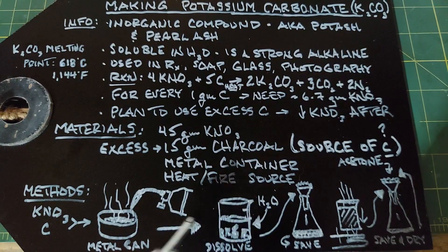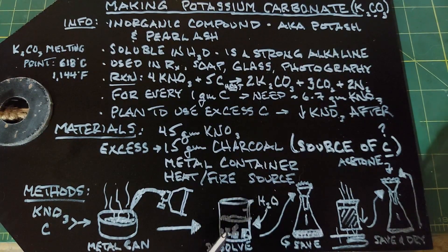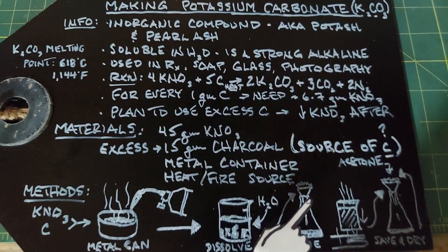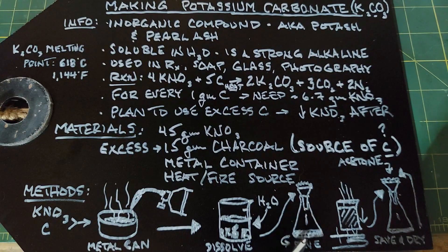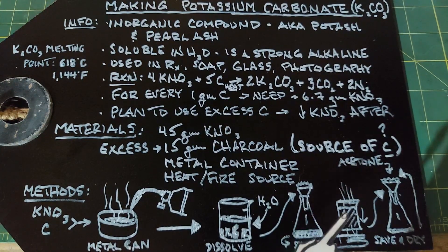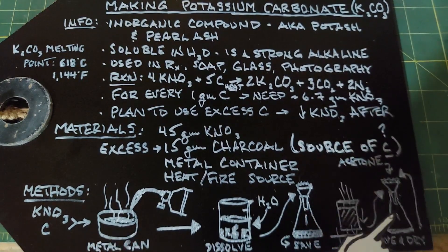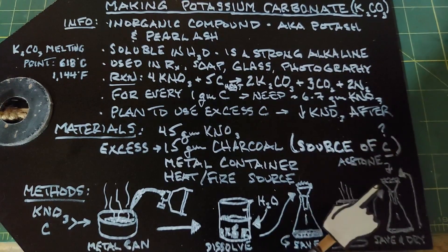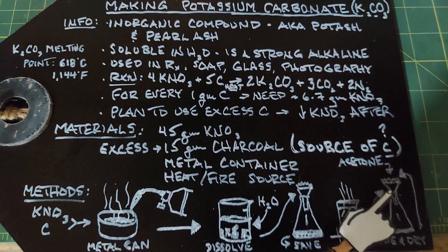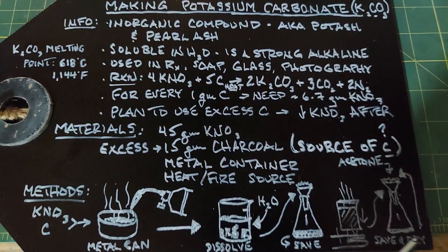Once we've produced the potassium carbonate, we dissolve it in water — since potassium carbonate dissolves but carbon doesn't, we filter the solution to remove chunks and debris. We save the liquid containing the potassium carbonate, heat it in a beaker until crystals form, cool it down, and filter again. To get the purest product, I'll wash it with acetone, then save and dry it.